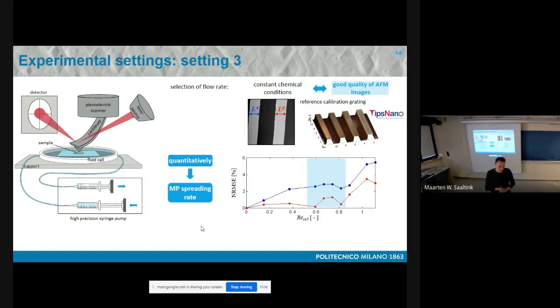Because the solution is staying put for some minutes, 6 minutes, and so in that time, the solution composition is changing. Is it changing a lot? No, it's not. It still stays well below saturation, within the limit of very low saturation. We did some tests considering the time that it takes to go above 0.5 or even very high. So you consider that it's more or less the same in terms of the solution. In these experiments, I think so. Let's say that we are quite confident about that.